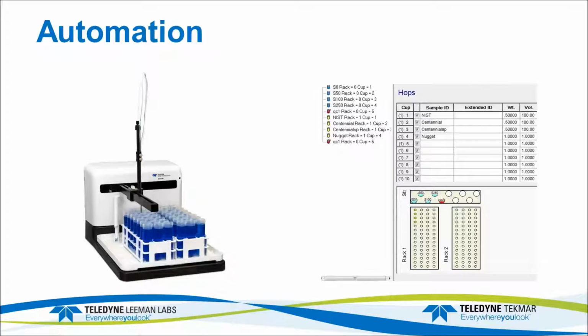Okay, automation. We set the run up on an autosampler. We used a CETAC ASX 280. You can see on the right-hand side the setup for the run. So initially, we're going to run the calibration for the standards. We'll run a QC, where we ran the 4 samples plus a spike in there, and then close the analysis out with the QC.